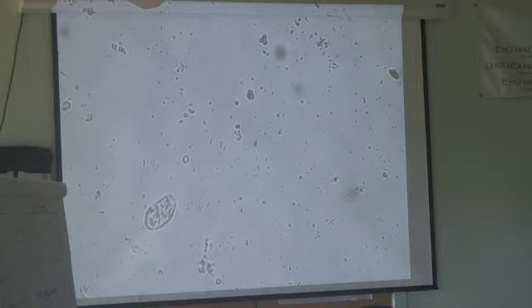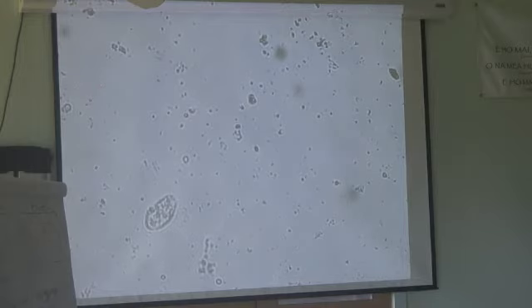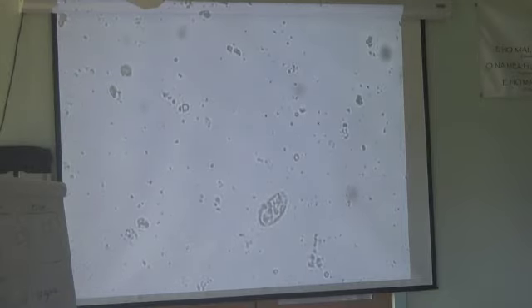See that bacterium? Anyway, zoom. Come on, move. Again, they'll just sit there. They'll probably just take off again and then I can see them. But that is a bacterium. See how small he is? There was another one there. So we got multiple bacteria up here in that corner, which is a good thing. It's different species.